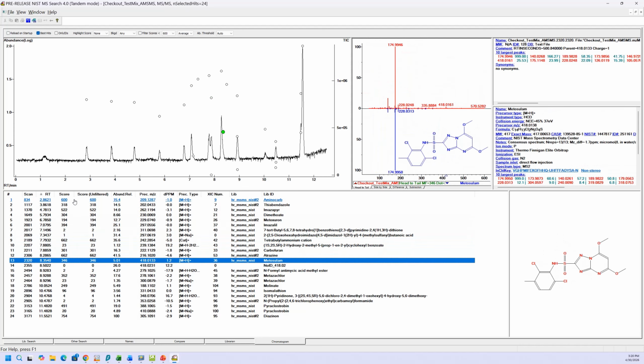So that's the basic operation of the system. I might have missed a couple of things, but read my handout just to make sure that I didn't leave out something. But I think that'll get you started in the processing of data within these new programs. Thank you.